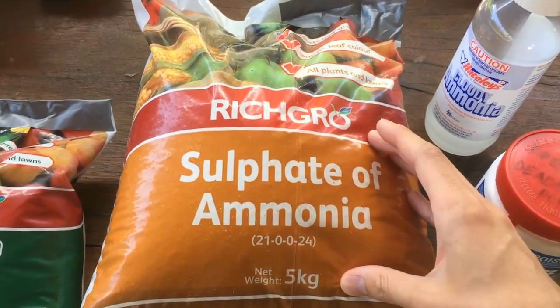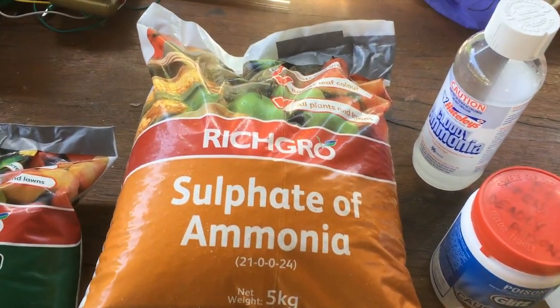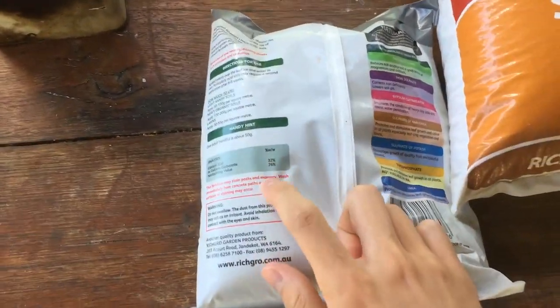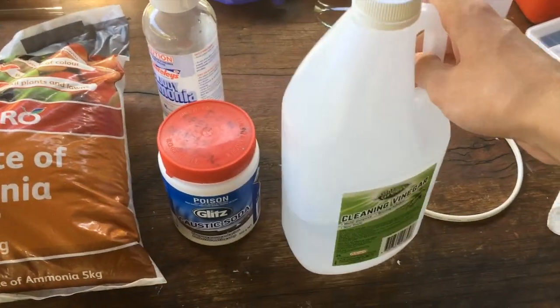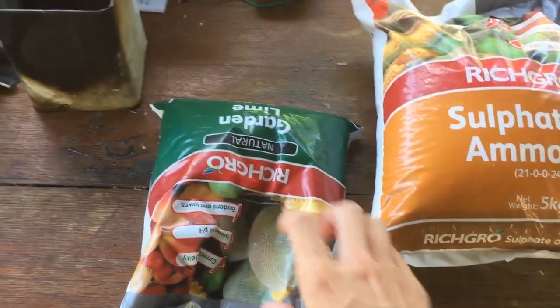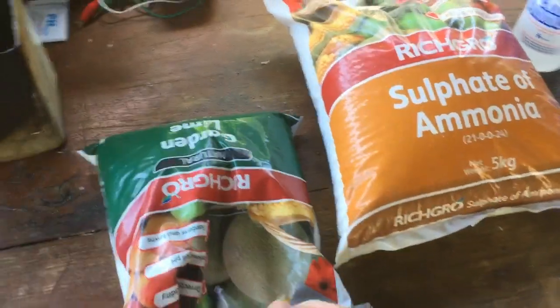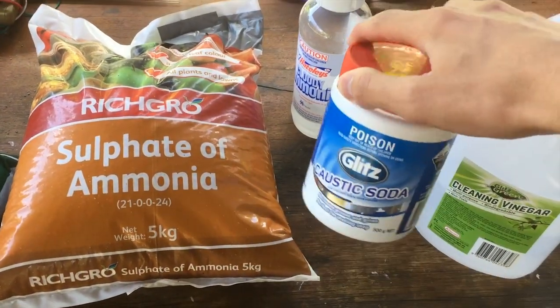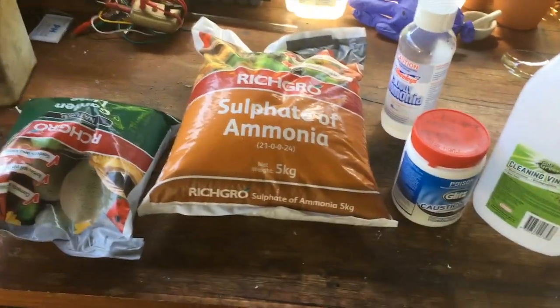So we'll be left with a pretty pure solution of ammonia in water, and then we'll be able to filter off the calcium sulphate precipitate. In order to make the calcium hydroxide we're going to start off with this garden lime which has a content of calcium carbonate. First of all we're going to react it with some vinegar or acetic acid, and once we've reacted the calcium carbonate with the acetic acid, we'll have a solution of calcium acetate. We'll filter off the impurities and then add sodium hydroxide to precipitate out our calcium hydroxide.